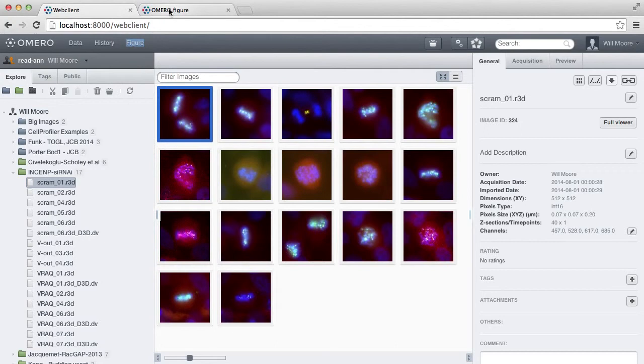So that you've got OMERO Figure in one tab and the web client in another, and can move back and forth between them.